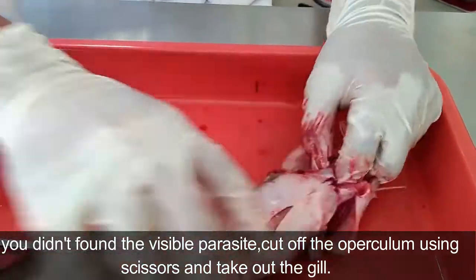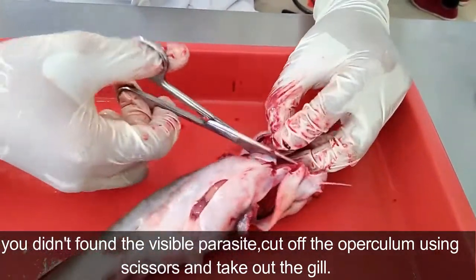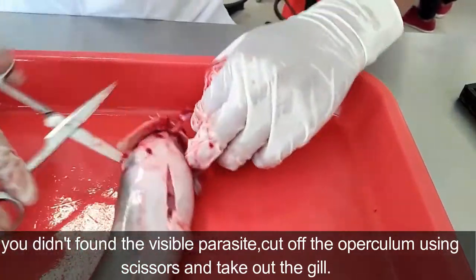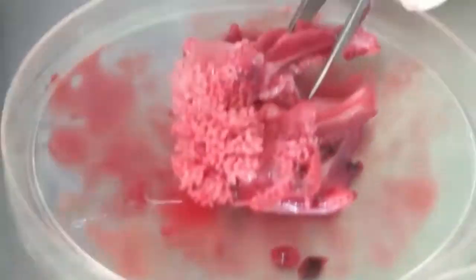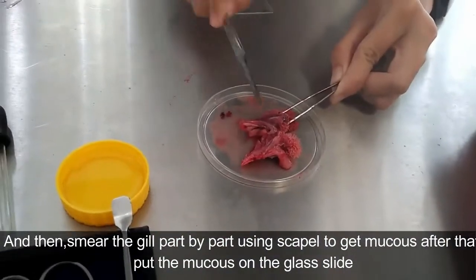If you didn't find any visible parasites, cut off the operculum using scissors and take out the gill. Then smear the gill part by part using a scalpel to get the mucus.